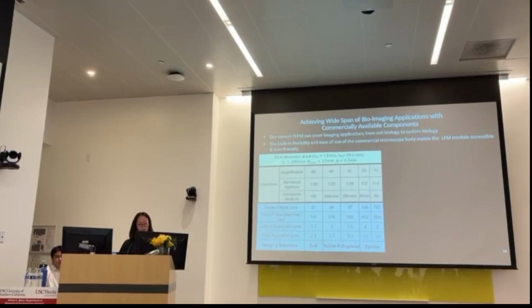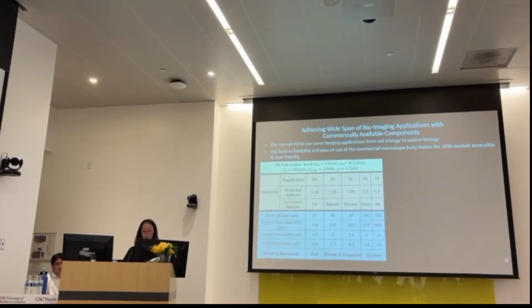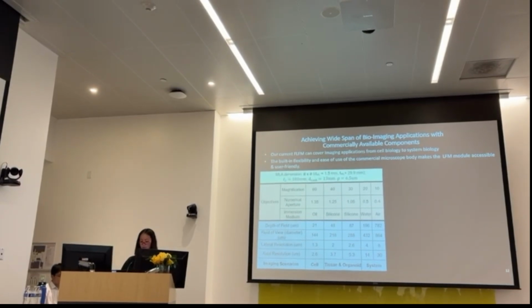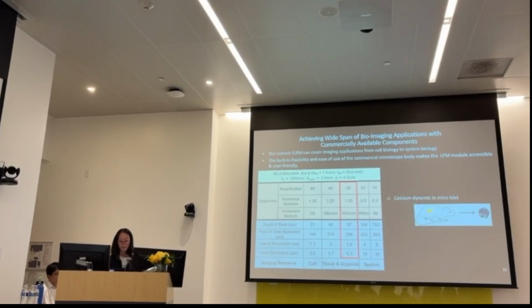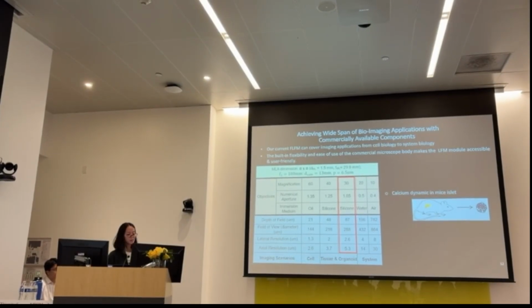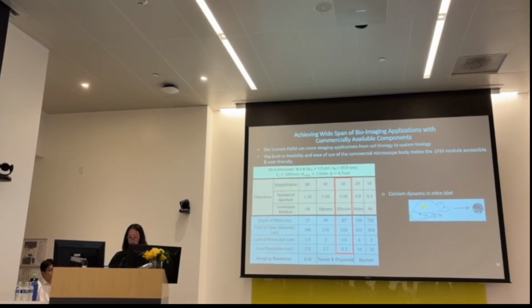Moreover, the built-in flexibility and ease of use of the commercial microscope body makes the light field module accessible and user-friendly. Today I'll showcase one very exciting result, which is to use 30x for imaging calcium dynamics in mouse islets.